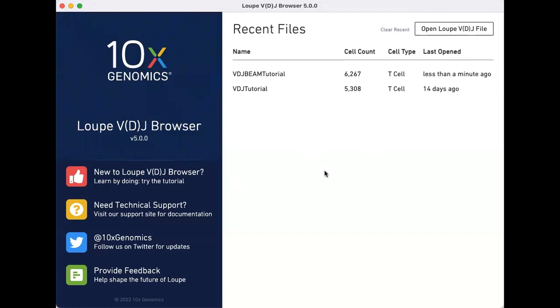Open the dataset by clicking on the VDJ BEAM tutorial shown on the browser's home page.